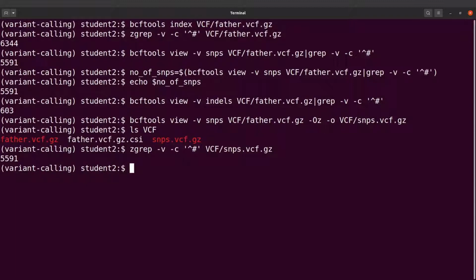Aside from filtering using the variant type, you can also filter using other criteria such as quality, chromosome position, chromosome number, etc. So we are going to look at a few examples here. To filter, there is a command that allows you to specify an expression. So to filter a VCF, we use bcftools filter. Then we can give our expression.